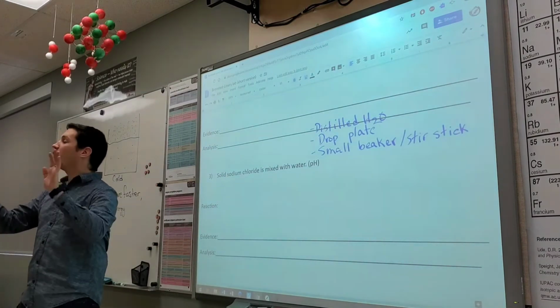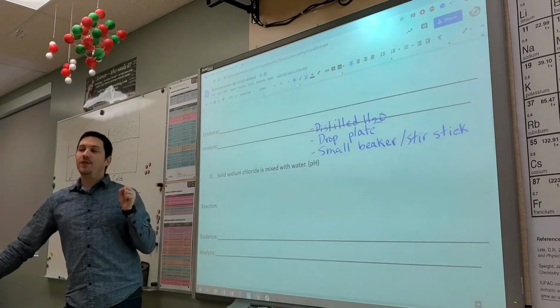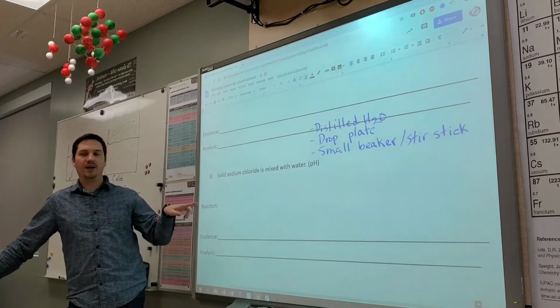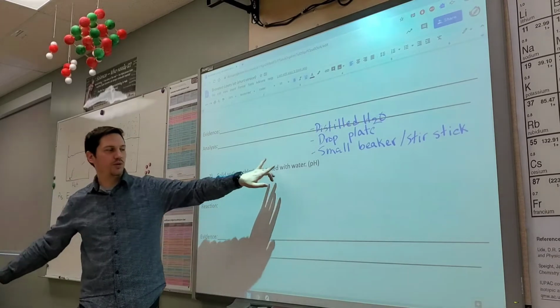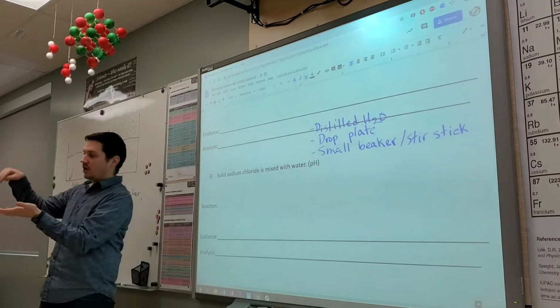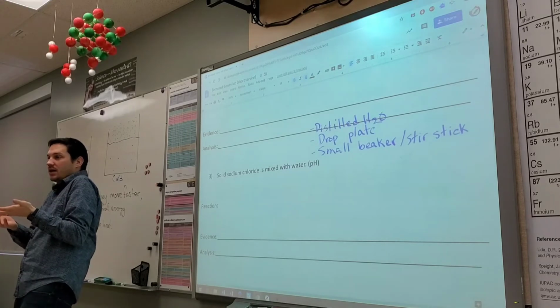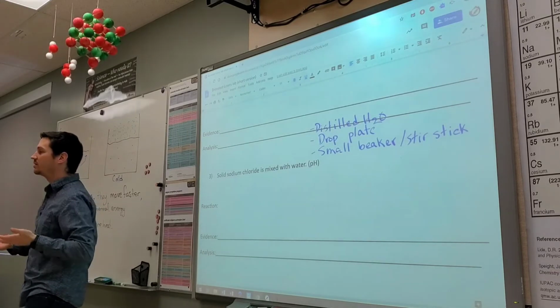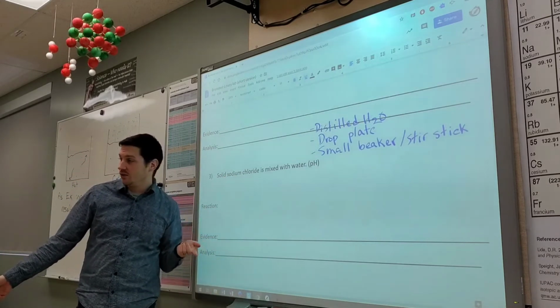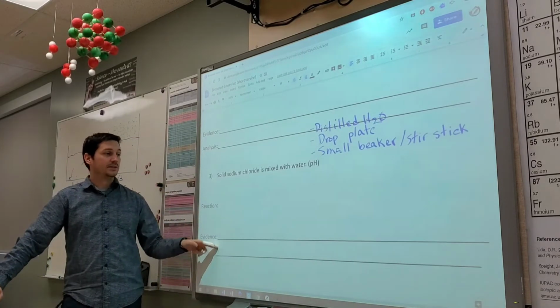Now, under normal circumstances, like a grade 9 student or whatever, a person who wasn't in Chem 30, would they be able to tell you what kind of a pH salt mixed with water would be? Maybe, right? When you mix salt with water, are you really, really concerned about getting a chemical burn on your hand because of that? Probably not, right? Okay? So in your prediction, you should predict that you're going to make something neutral, or at least a neutral mixture, right? Okay.